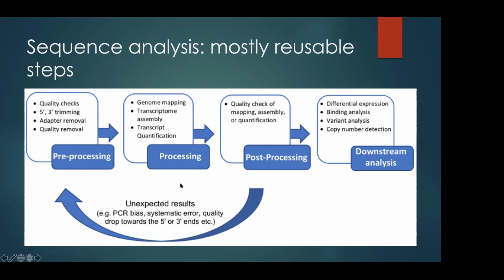Here in the processing steps, we split the whole data analysis cycle and processing step with these boxes here. But first, pre-processing is just to prepare your files for processing. It means in the pre-processing step, you're just removing, for example, adapter sequences, barcode sequences, or if there are some unique molecular identifiers in your reads, you detect them, group them, and put the UMI into the header, and then you remove it. You just collapse all the reads using UMIs.